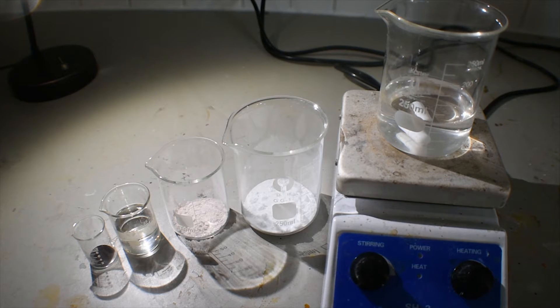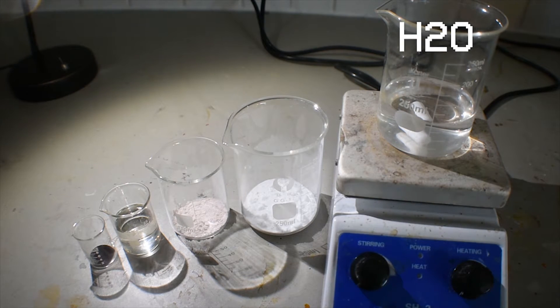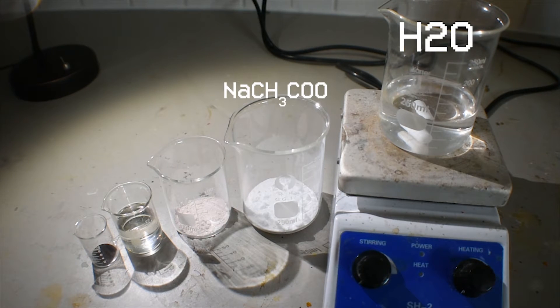The ingredients needed for this complex are 100 mL of distilled water on the right. To the left of that is 13.6 grams of sodium acetate. To the left of that we have 5.2 grams of manganese-2 chloride. Then, slightly farther left, we have 20 mL of acetyl acetone, or 2,4-pentanedione. And finally, on the far left we have 1.04 grams of potassium permanganate.